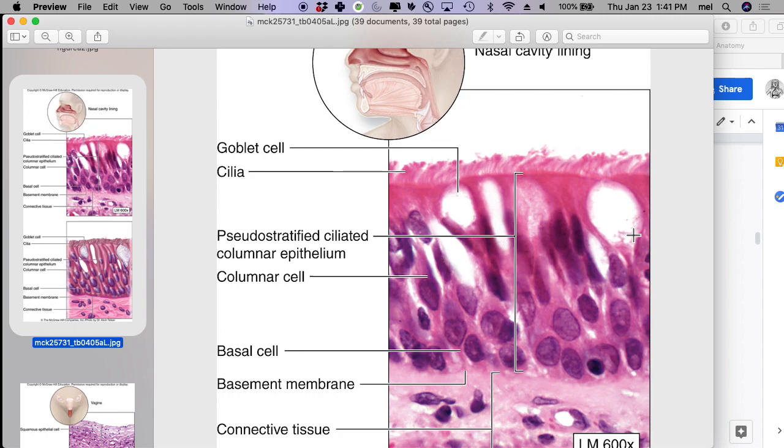Is a goblet cell lumen as well? No, it's not. It just doesn't stain. It's actually a full cell. It's not empty. It just doesn't stain with that protein staining technique. You just get used to looking at it in context. It's within the epithelial tissue, so it's a goblet cell and not a lumen. But I can see totally why you would think that. It's just not empty.